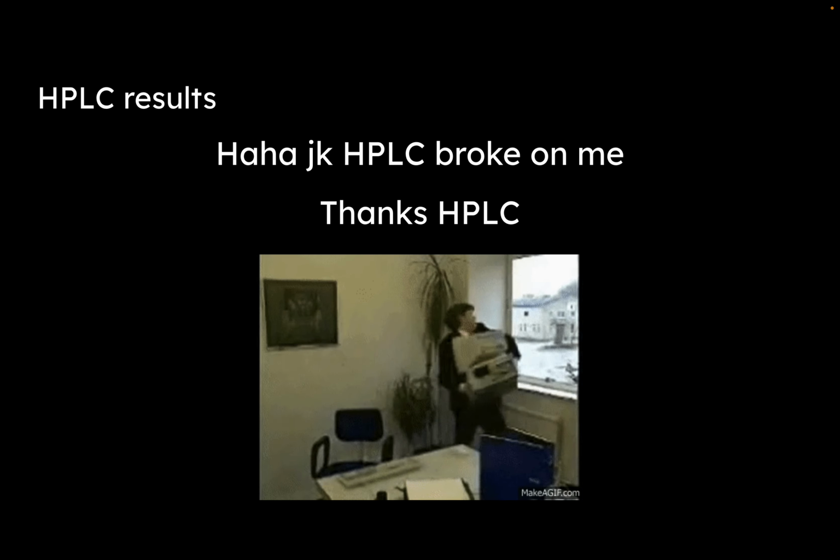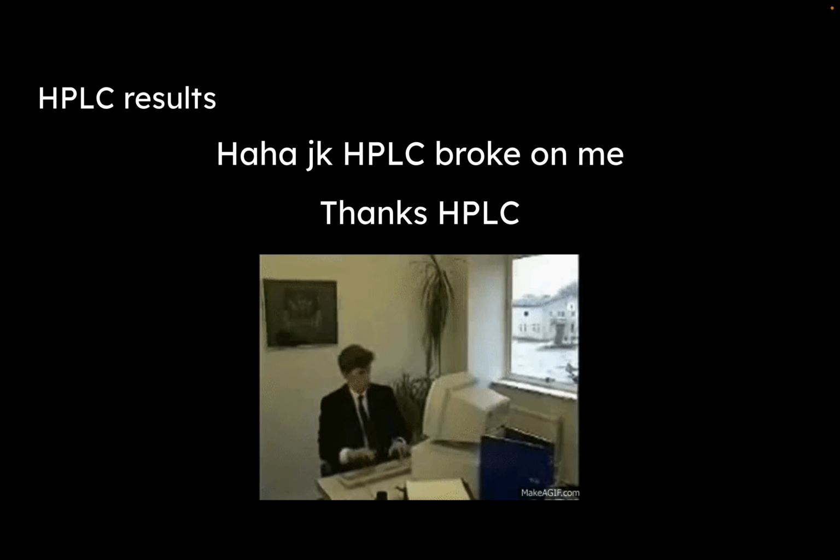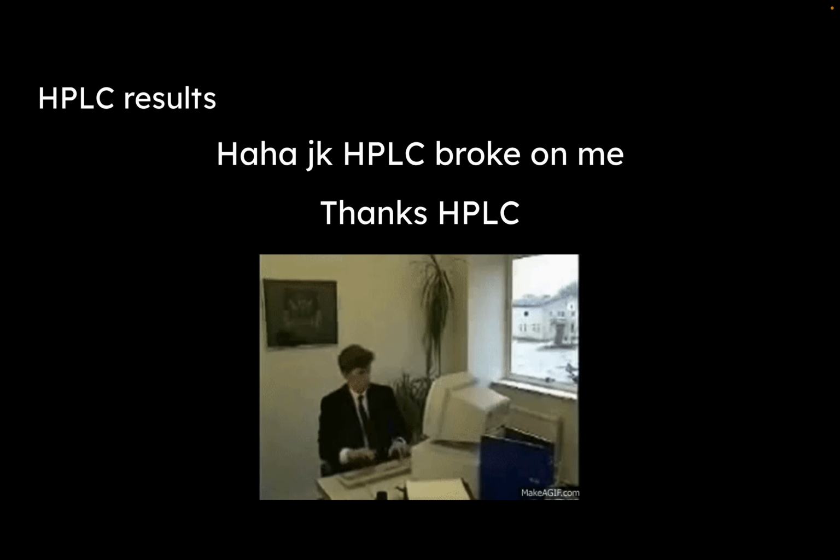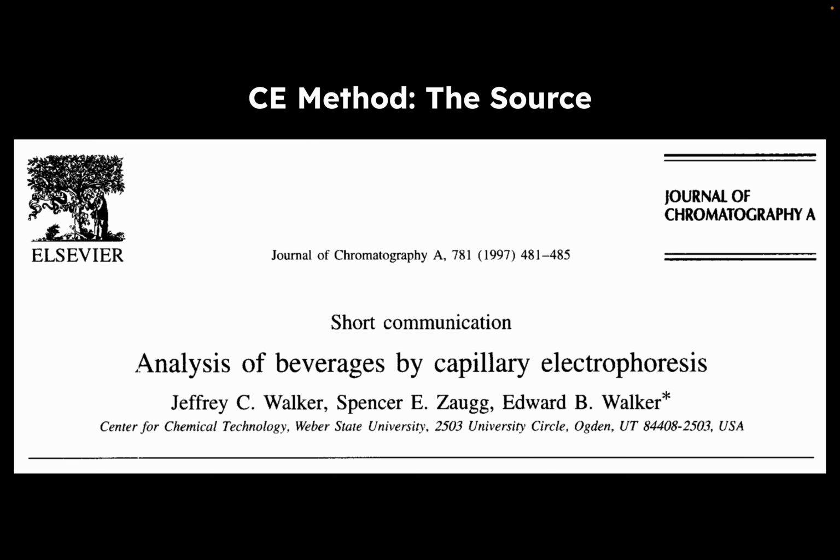But yeah, I felt like throwing the HPLC out the window, right? I was not getting good data at first in the CE method. I just wanted something different. And then the HPLC decided, nope, I don't care. I'm not going to work. So maybe my fault, maybe the machine's fault. Shimadzu will figure it out, and blame me if you want.